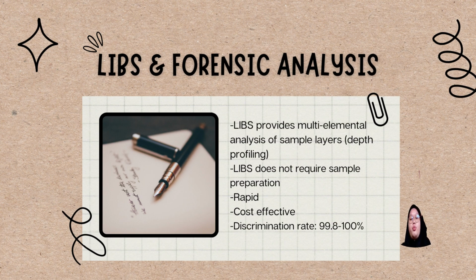Laser-induced breakdown spectroscopy provides a multi-elemental analysis of sample layers ablated by laser pulses, thus allowing depth profiling measurements. This technique is only micro-invasive. It does not require sample preparation. It is rapid, cost-effective, and different portable LIBS instruments are available on the market. All these advantages promote LIBS as a technique to be used in forensic applications.